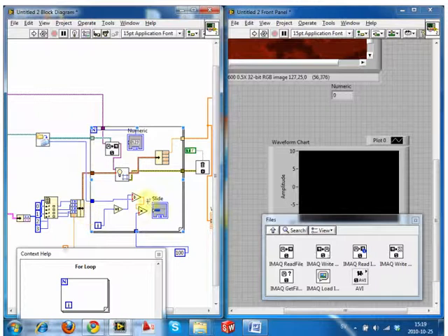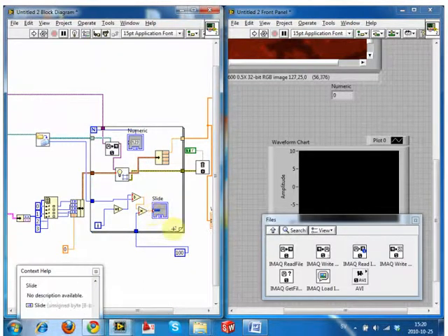If we have it inside the loop, it has to read the value 100 and then act upon it. Since it's a constant value, you should try and drag them all outside the loop. And then you just wire that up into this guy. And essentially now you have a percentage meter for the progress bar.